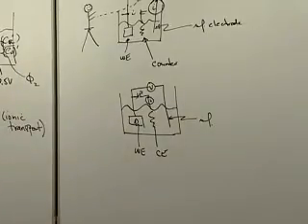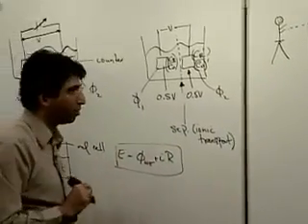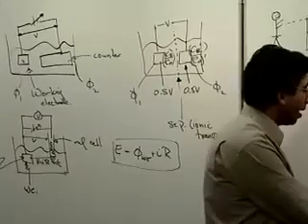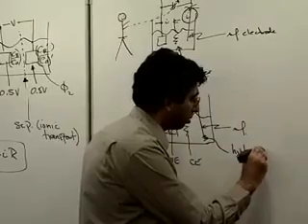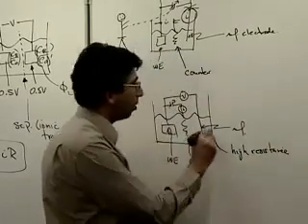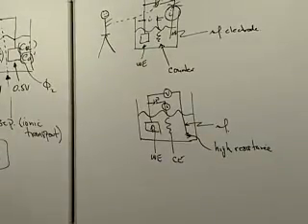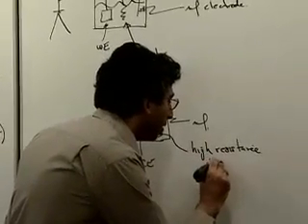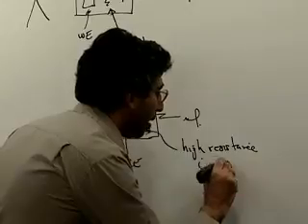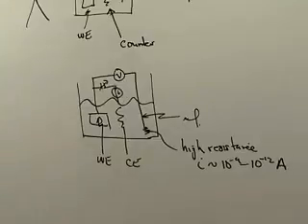OK. Now, the interesting thing about this design that I've just shown you is that since this is the operational equation, if we can have a very high impedance here, between our reference electrode and our working electrode and the rest and everything else. And if we have very high resistance, that means that the current will be very, very low. So we'll be typically talking about a current that's somewhere between, say, a nanoamp and a picoamp. That's going to get through this resistance. This resistance would just be a fine frit. Okay?